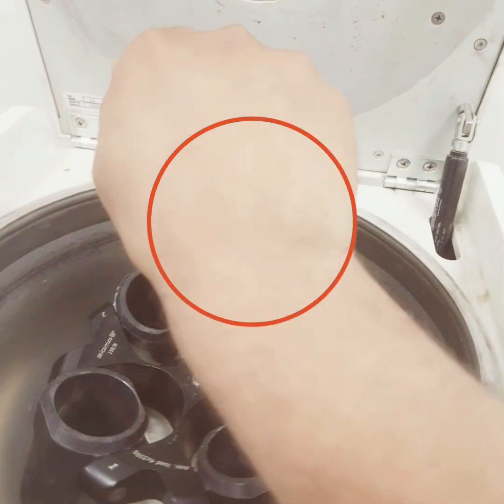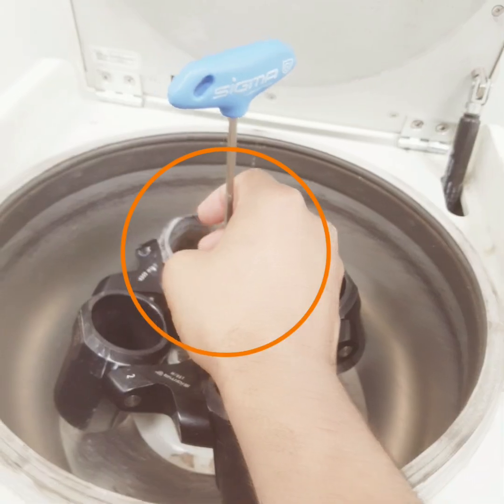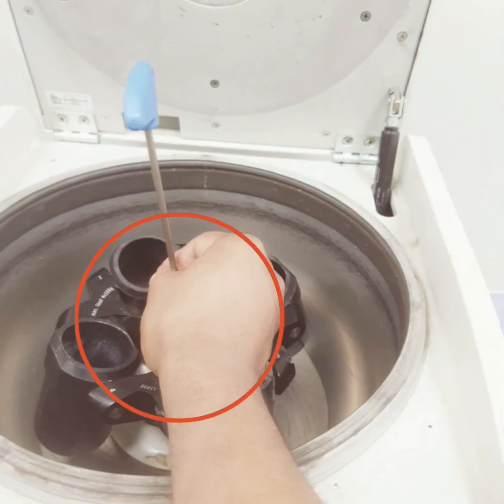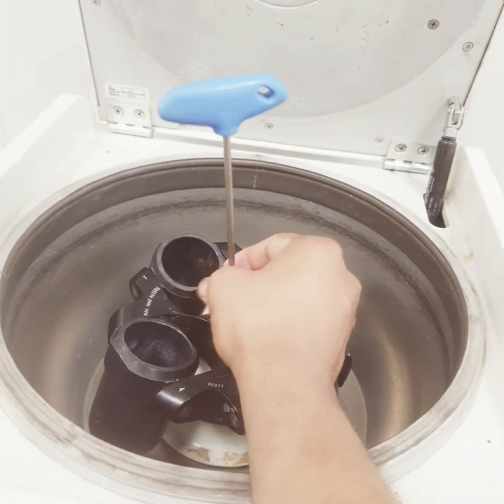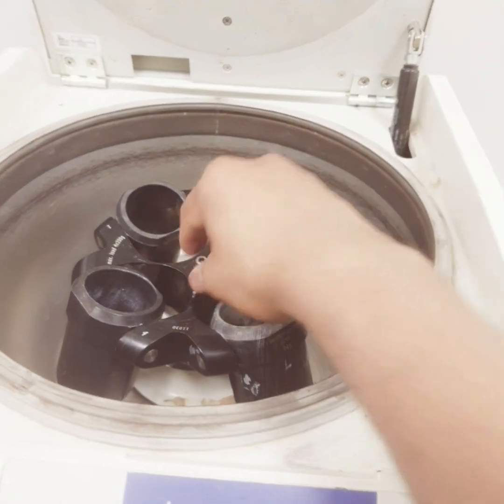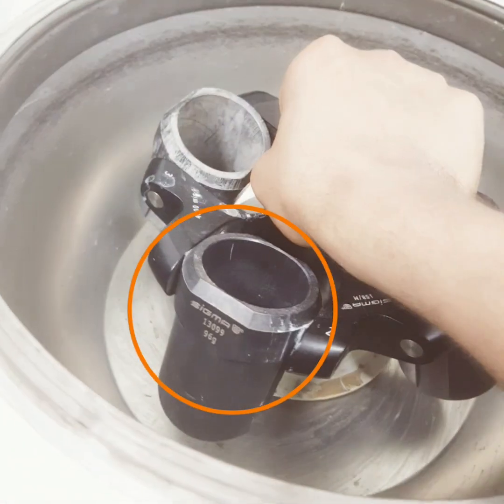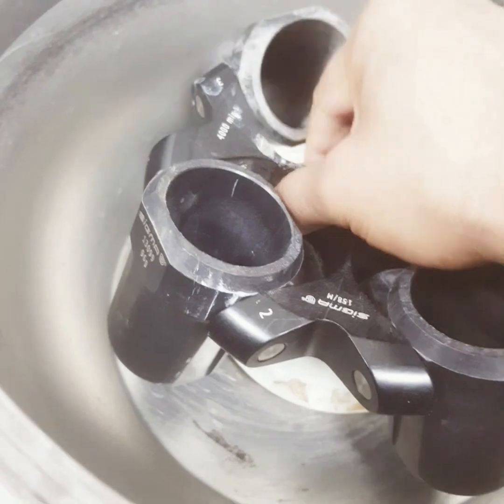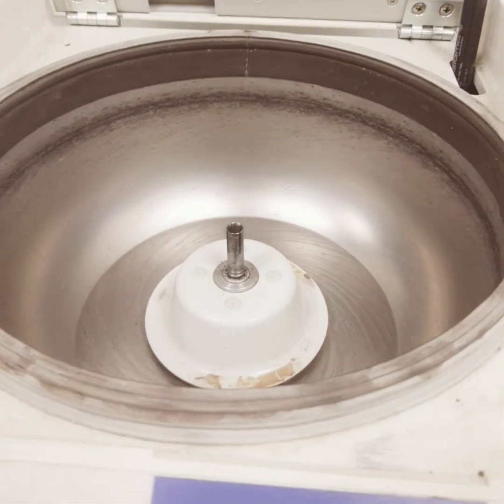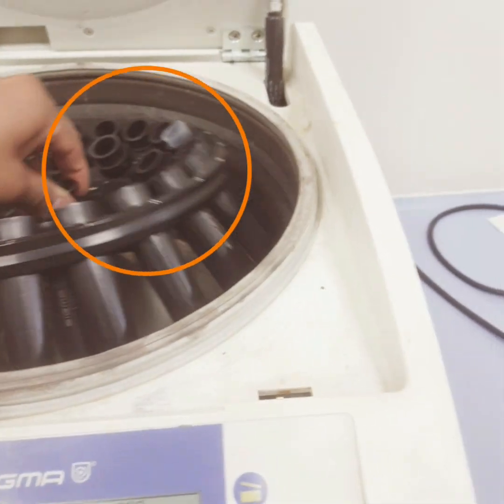You can see that this is a nut, and this is the screwdriver that comes with the machine. We are simply rotating this and then removing it. Then we remove this and simply place the new rotor in.